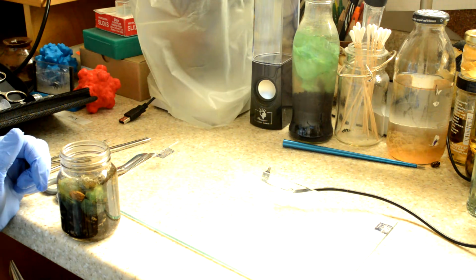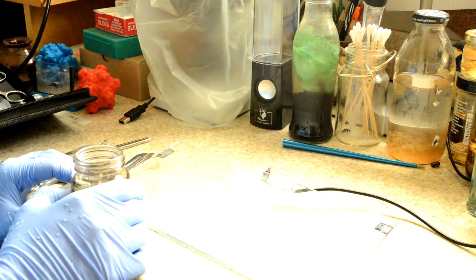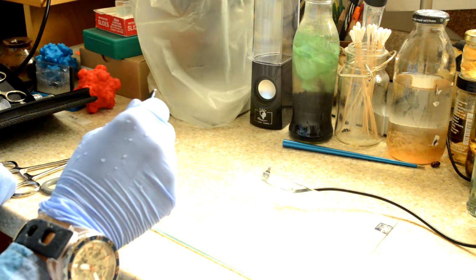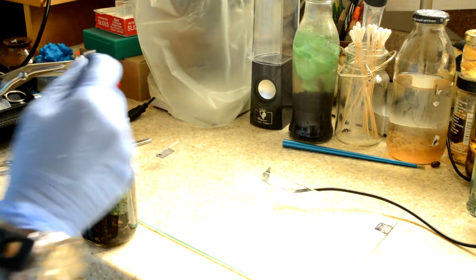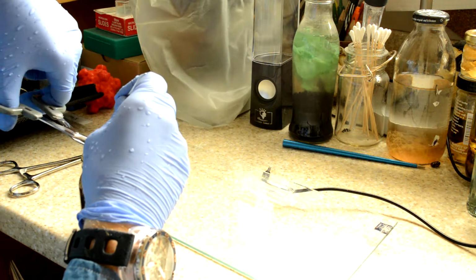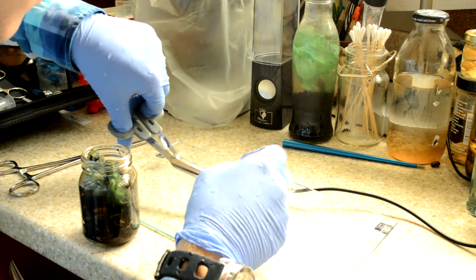Oh yeah, alright, so it looks like that. I'm not sure if you can see that, I hope you can, but it is brown and tarnished. Oh wow, this is great. This looks like there's been some serious breakdown in the structure. Let's cut a little bit off. There we go.